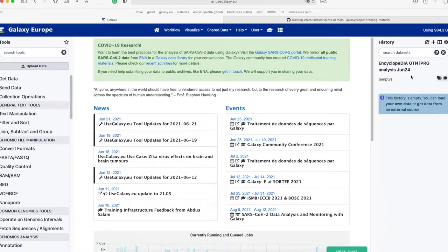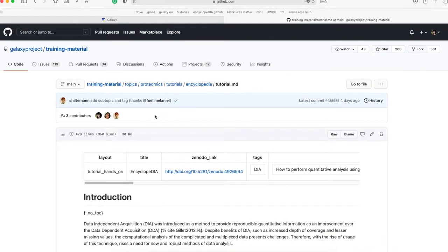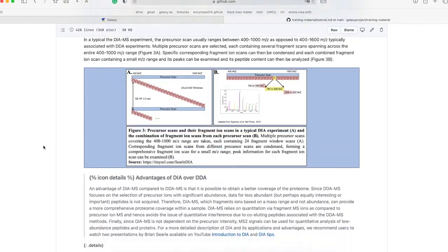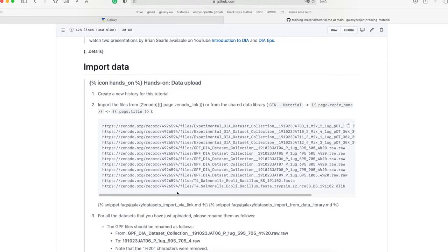Next, we will be importing the data. For this tutorial, we are using IPRG DIA data. Accessing the data is simple. Go to the linked Galaxy Training Network tutorial for Encyclopedia that is associated with this video. Scroll down to the Import Data section. Here you will find many Zenodo links, which is how we will be importing the data. Zenodo allows for online storage of files and direct import to your Galaxy history for analysis without the need to download very large files onto your computer. To do this, press the copy icon, which will copy all of the links, each associated with a data file needed to run the Encyclopedia workflow.